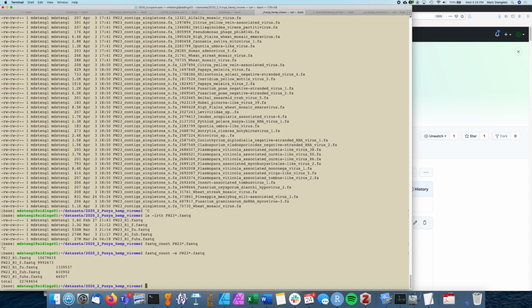After host filtering, that number got cut about in half, from 1.3 million to 0.7 million, basically. So only about 50% of the sequences got removed by mapping to the wheat genome, which is actually kind of surprising. That's a lot of non-wheat reads in the data set. So about 50% of the data was not from the host, if you take that at face value.